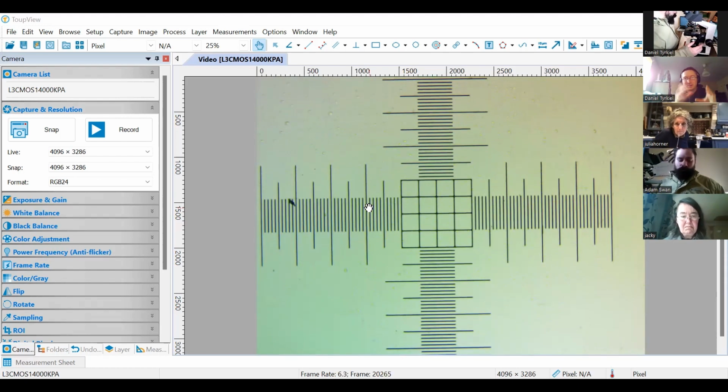We do everything through the oculars because it's just more accurate to actually look with your eyes than count on the computer screen. I know of a Dr. Ingham's student who has got bad eyes, and he strictly relies on the screen and on a well-calibrated grid on the screen. And so you can basically use this to calibrate the grid on the screen.